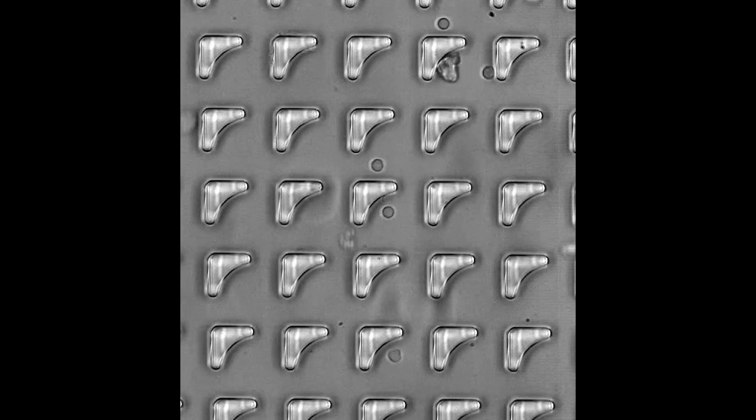The team can sort 100 million reticulocytes in less than two hours, about half the time that it would take with FACS. The scale we're at right now with the 100 million cells allows us to start doing practical experiments in terms of lab-based research, and that would be already a massive step forward.